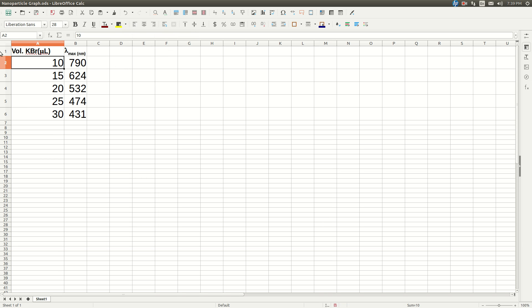So I've already input the volume of potassium bromide added in microliters as well as the lambda max, the wavelength of maximum absorption for each of my solutions that I made. And so all you do is you highlight the numbers. Don't highlight the words, just the numbers.